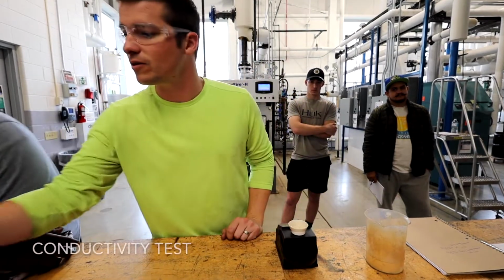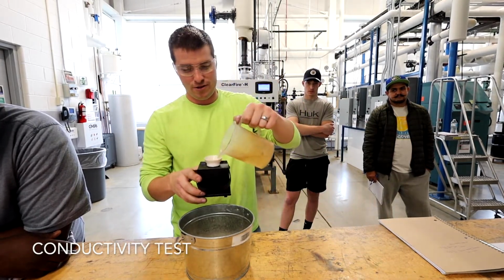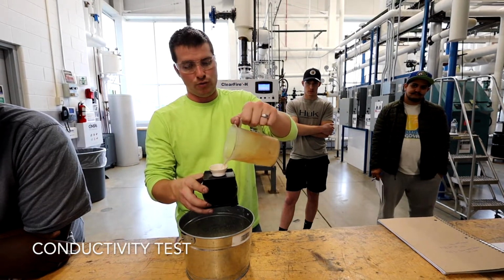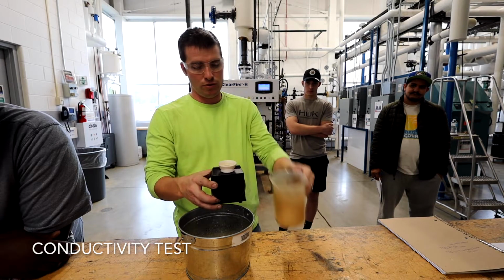Do we have, look at that, my slop bucket. All right, I don't want to dirty the floor up here. All right, so we'll want to grab a sample. We'll want to go ahead and rinse this cup out a couple times. All right, and then we'll want to read.